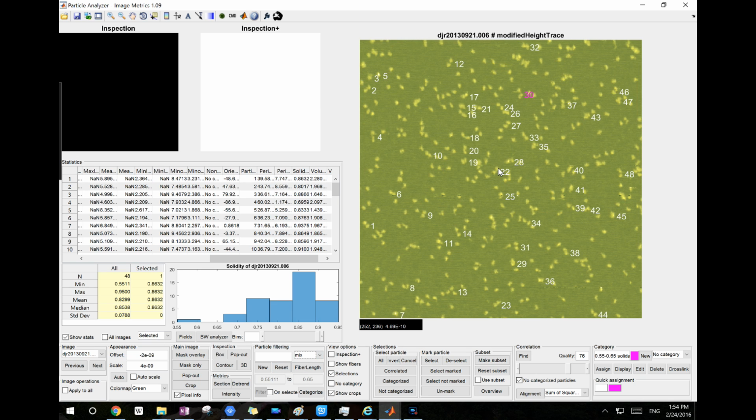So now I will redo this process again. I have the particles that are already selected by filters. Remember what I did? I right click this because I already assigned particle filtering. When I click any of the filter options, it will let you assign the category after filtering. So now I assign a category in the mix parameter.